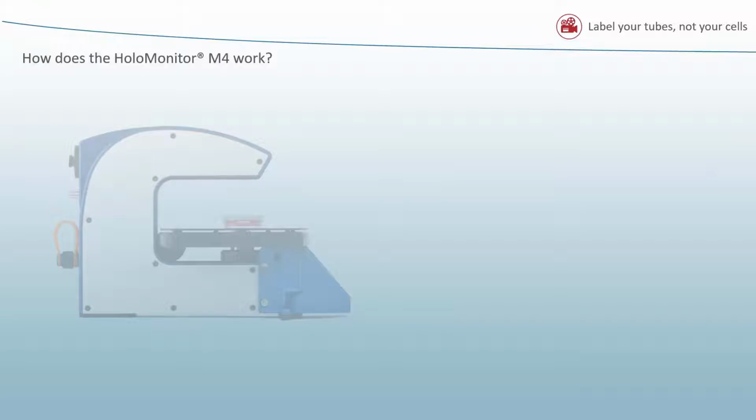In the next part of this webinar, I want to introduce you a little bit more to our HoloMonitor system. You have a schematic drawing here.